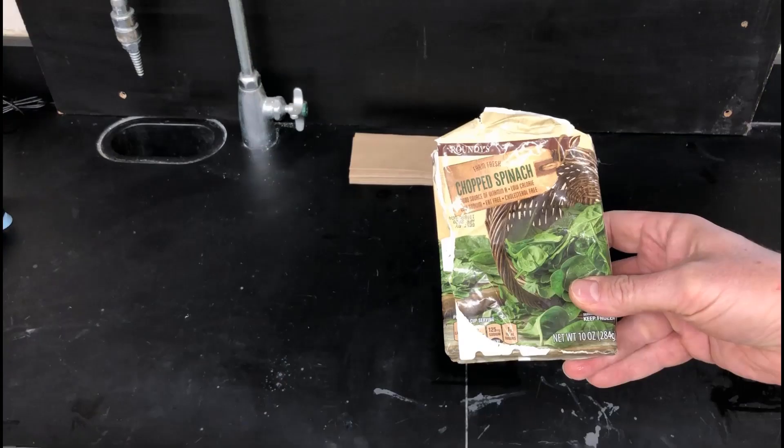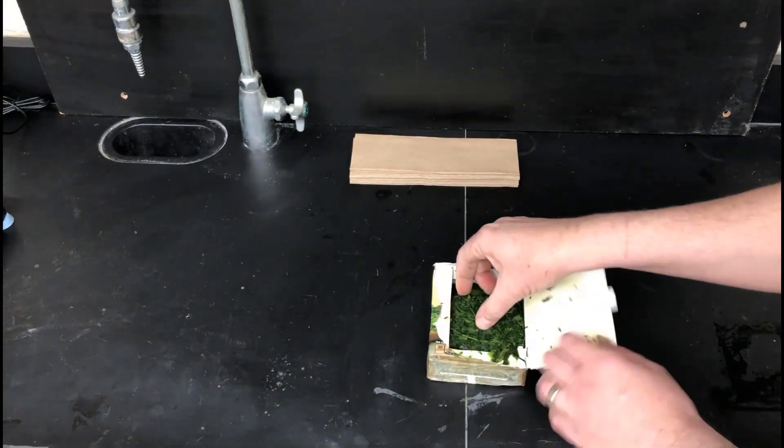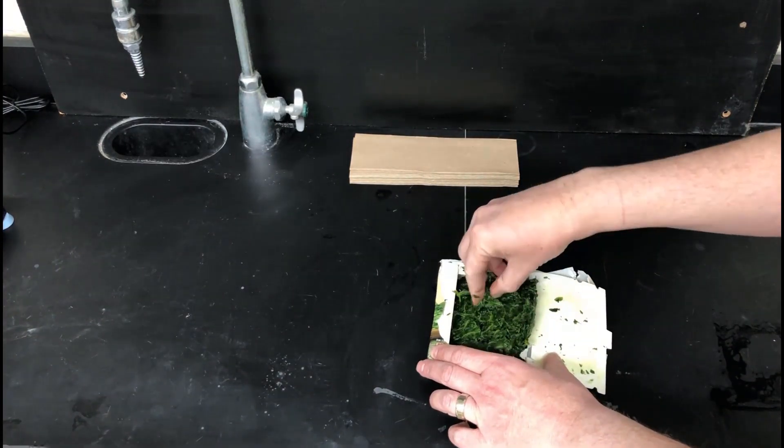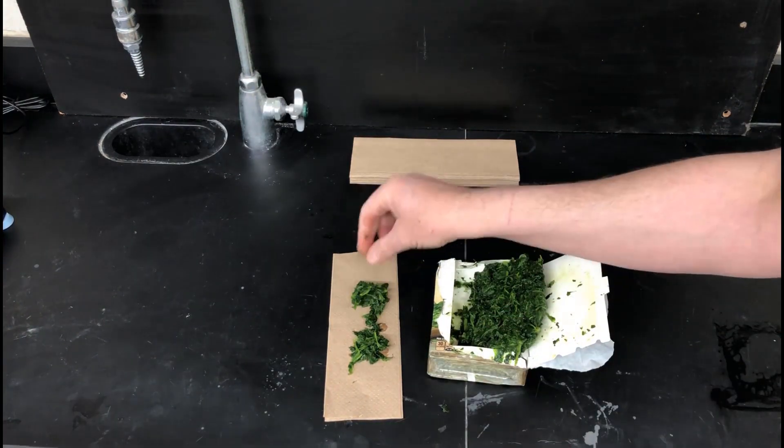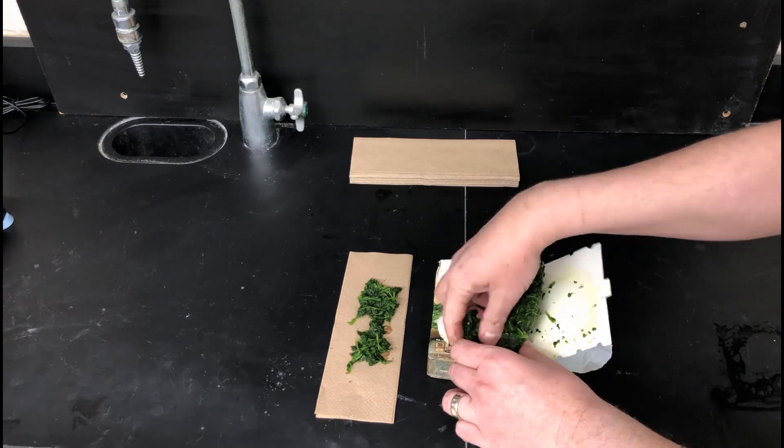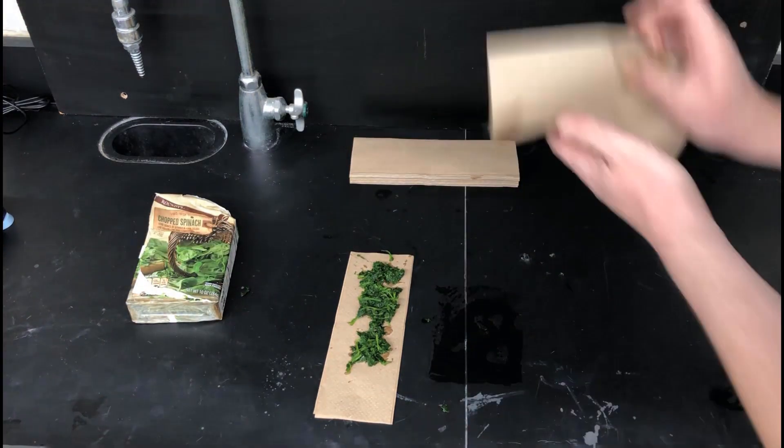So you're going to get some frozen spinach here. This is standard stuff from the grocery store. You'll need to thaw it first, but then just grab some tufts of it and put it on some paper towels.